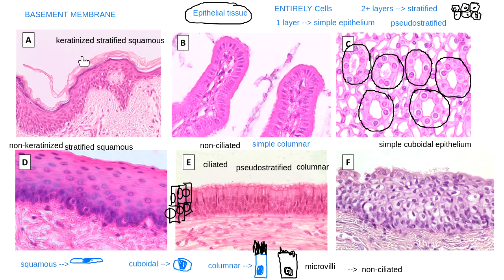So when we talk about transitional epithelium, it is a type of tissue where the cells inside of it change their shape. The best way for you to identify transitional epithelium is to look at the top surface. Notice how up here it's almost bumpy, like a cloud that's getting ready to grow bigger. So I see a bumpy surface on the outside, and all of these different shapes mixed up inside this tissue.